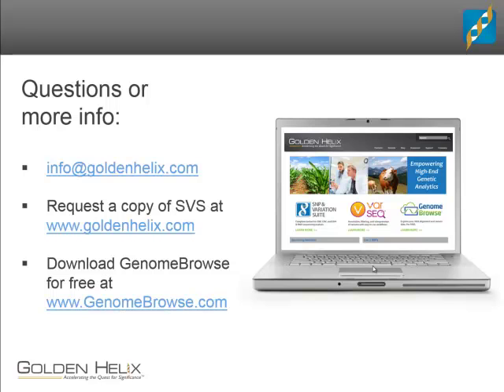Okay. So I will try to answer as many of these questions here as I can. We've got some really interesting questions that have come in along the way. First question, how do I create an input file for SVS? The primary supported input format here is going to be a VCF file. All of the examples that I showed today were based on reading in VCF files directly from the 1000 Genomes project.